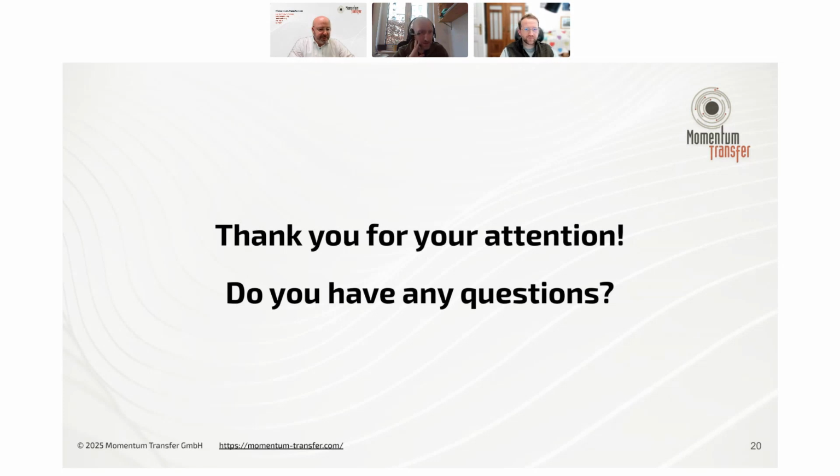How is it different from Expert HighScore XRD data analysis? There are various things that are very analogous in what you're doing, because the process is quite similar. To be honest, I don't know the specific features of HighScore, so I'm sure the search algorithm it uses is a bit different, and there are different features available. This is the first version of our tool.